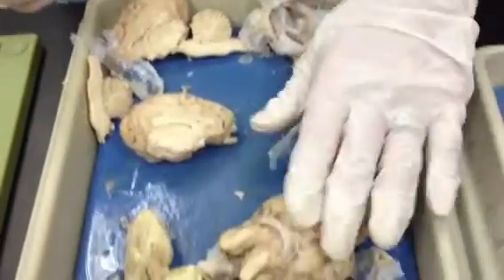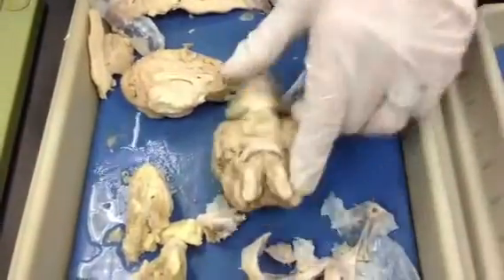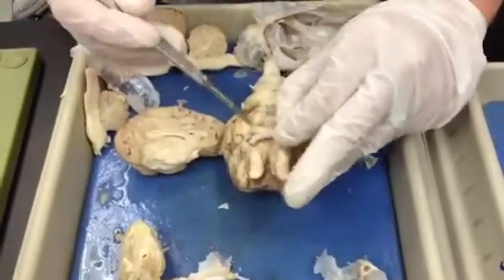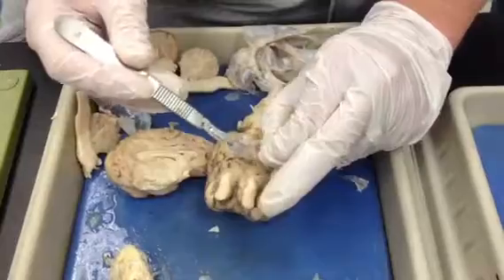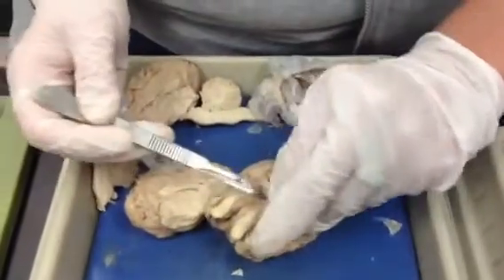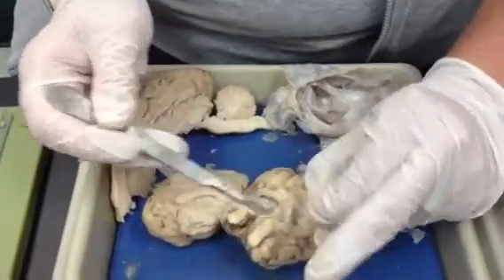So I'm going to leave this brain undissected because I want to use the optic chiasma for the practical for this one. So you could probably guess that's going to be a practical question. What? I just spent so much time on it. Take a picture of it.